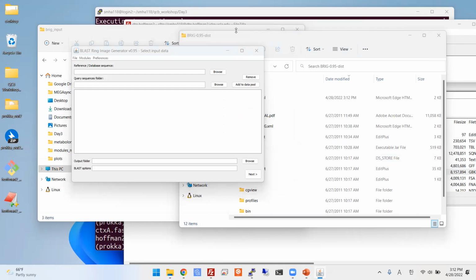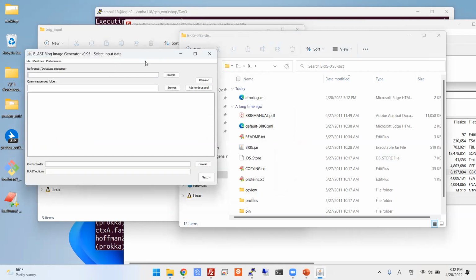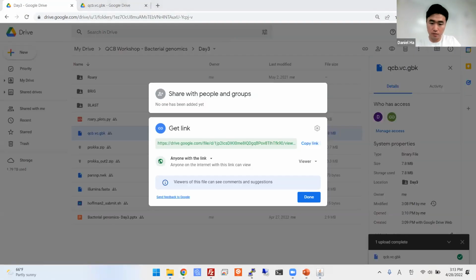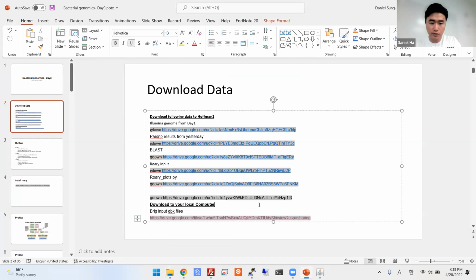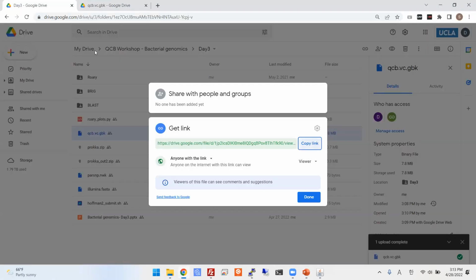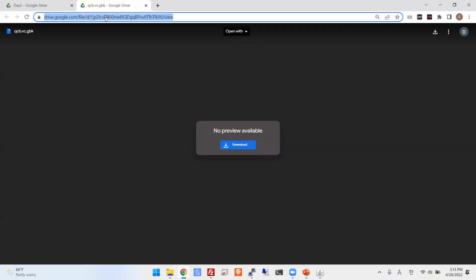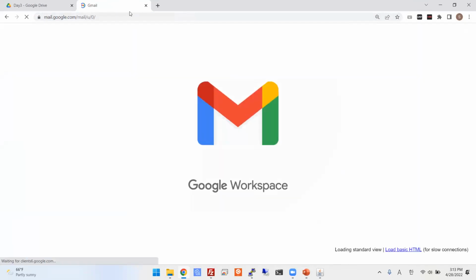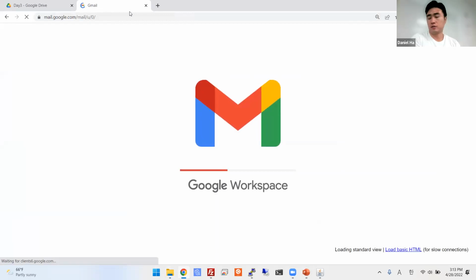I'm still having trouble finding the Korea and Bangladesh files. Should that be in the BRIG folder I unzipped? No, I shared that to the email. Oh, that was what you emailed us? Yeah. Okay. The link on the PowerPoint was in the trash for some reason.